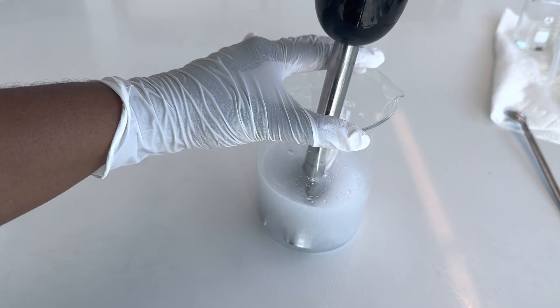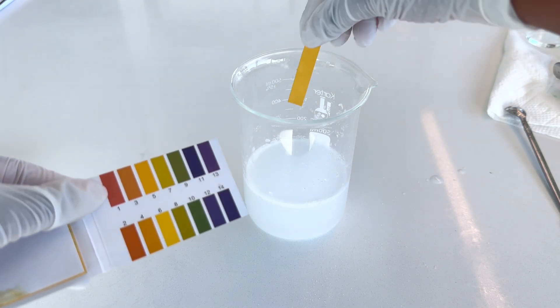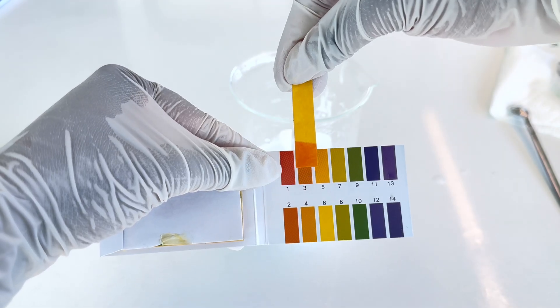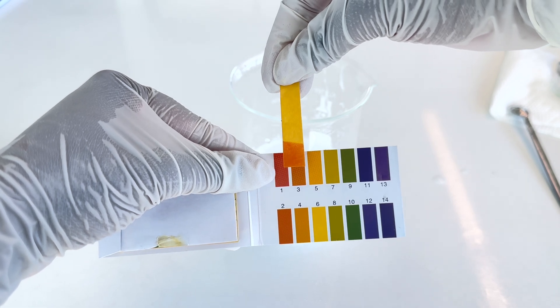Once it's finally hydrated, I let it sit for another five minutes just to settle. I then take the pH again, and due to Carbomer's acidic nature, the pH is now around 2 to 3.